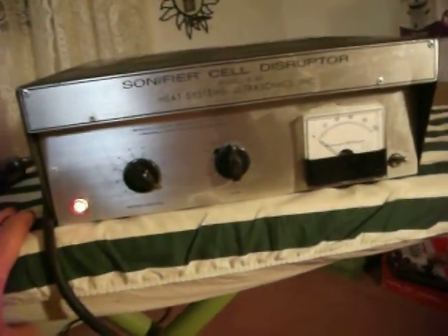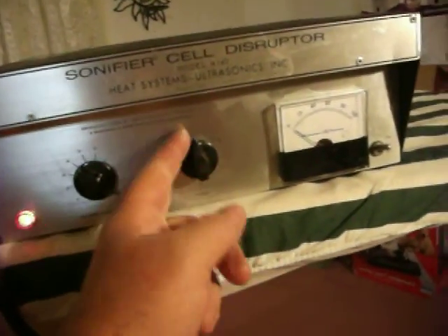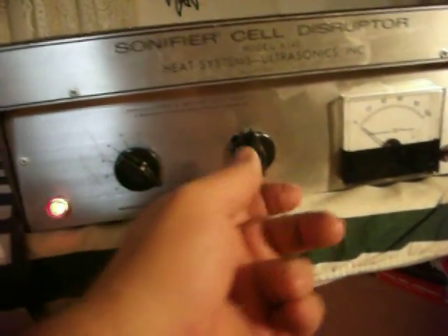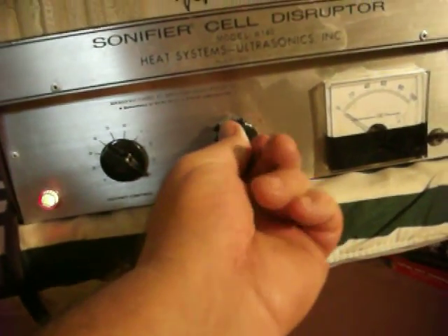Okay, now turn it on. Don't plug it in. Okay, now it's on already. The timer has to be on either a set number of minutes, or it can actually be on hold for indefinite, I suppose. We'll just turn it on for that — that's two minutes.